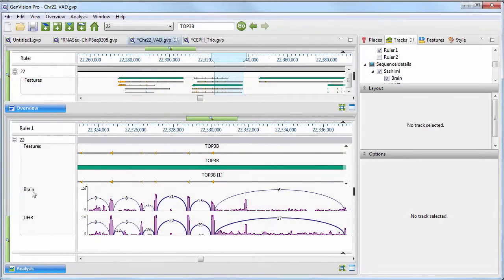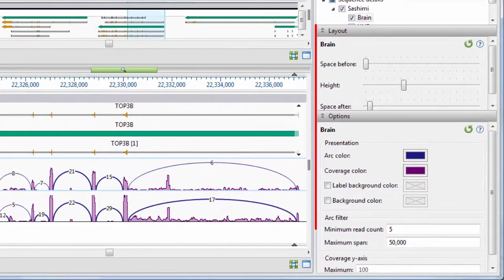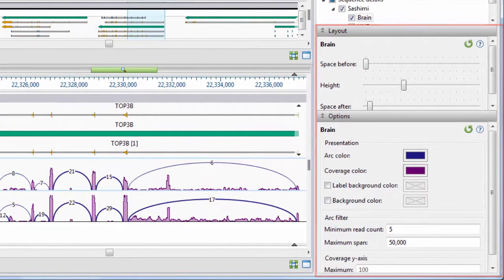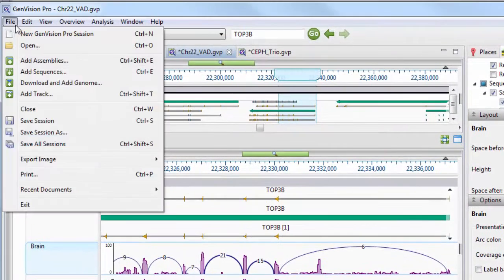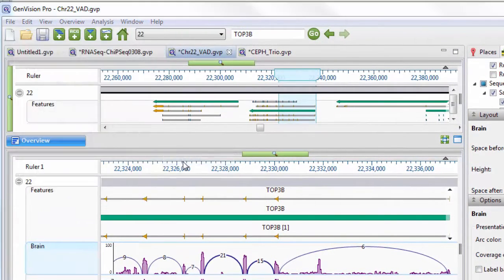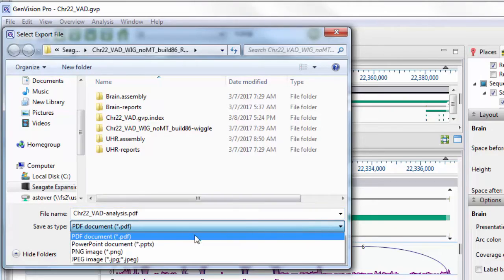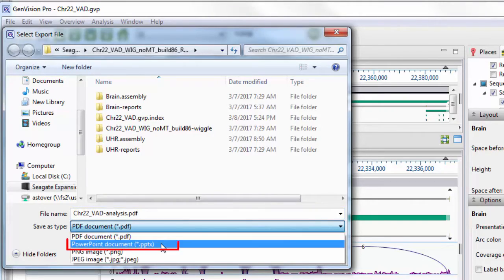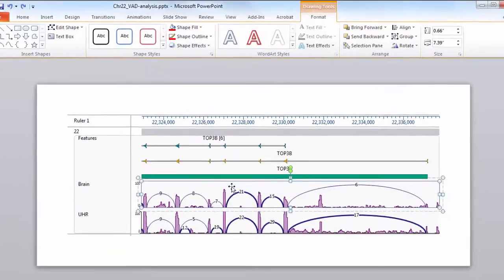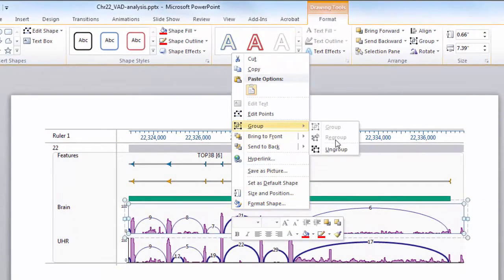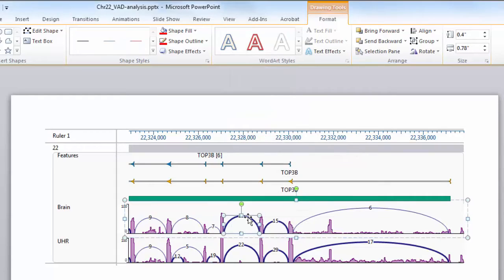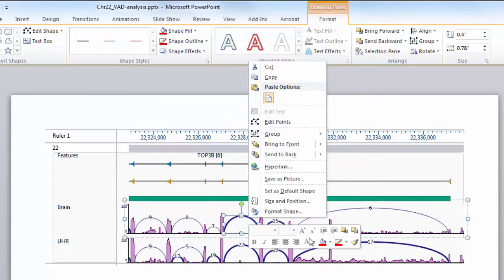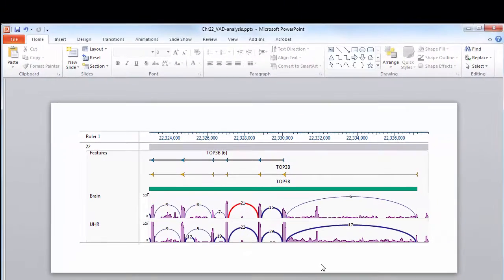Easily customize the appearance and layout of your data tracks. Then, export your image as a PDF, PNG, or JPEG file. Or you can even export a fully editable image to PowerPoint, where you can ungroup the elements of your image and further customize the appearance of your genomic tracks for publication or presentation.